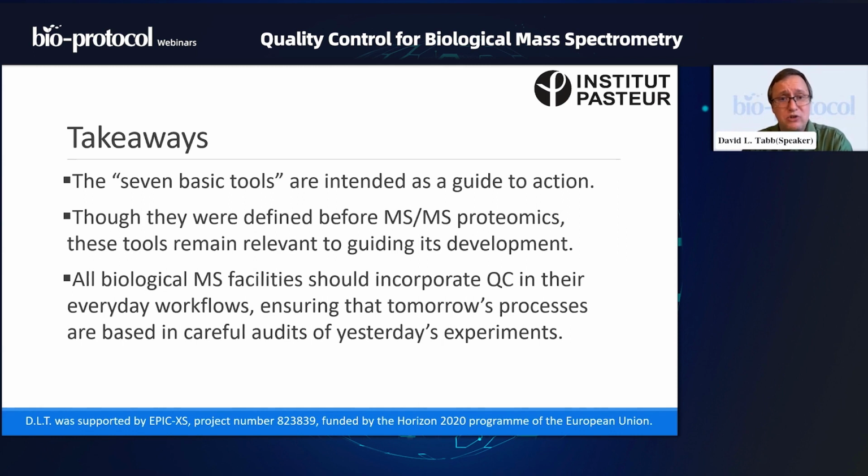All biological mass spectrometry facilities should incorporate QC in their everyday workflows. We need to ensure that tomorrow's processes are based in careful audits of yesterday's experiments. At present, a great deal of this is taking place in a very ad hoc way, and I think that as we become more structured about how we characterize past experiments, we will get better at making sense of them.